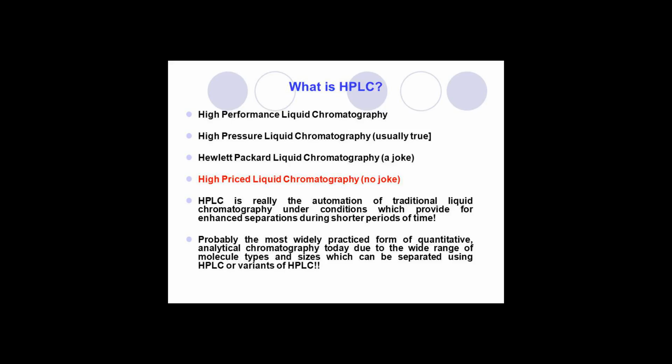Normal phase chromatography. Normal phase chromatography was one of the first kinds of HPLC that chemists developed, also known as normal phase HPLC, NPHPLC. This method separates analytes based on their affinity for a polar stationary surface such as silica. Hence, it is based on analyte ability to engage in polar interactions, such as hydrogen bonding or dipole-dipole type of interactions, with the sorbent surface.